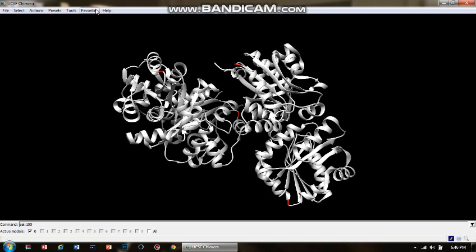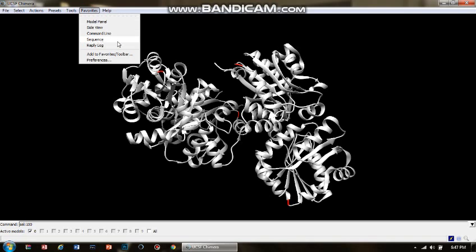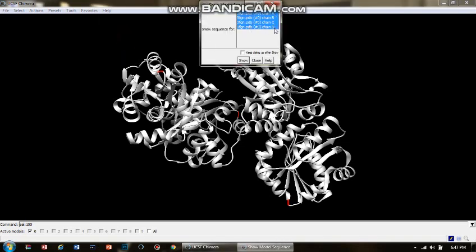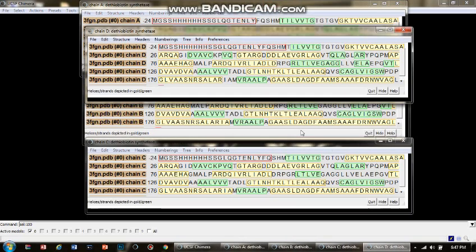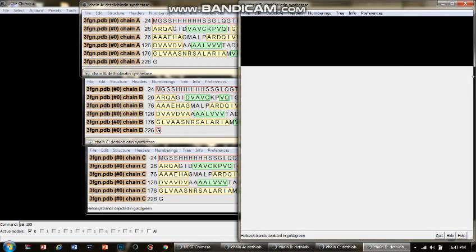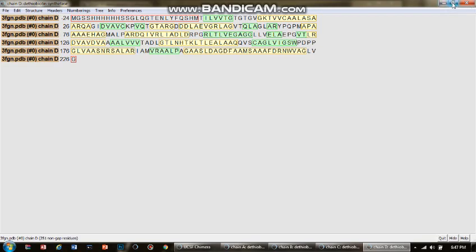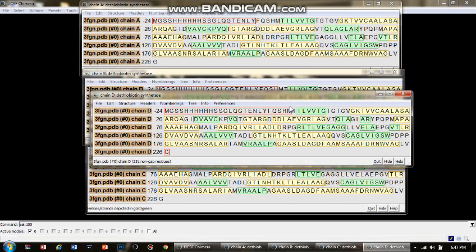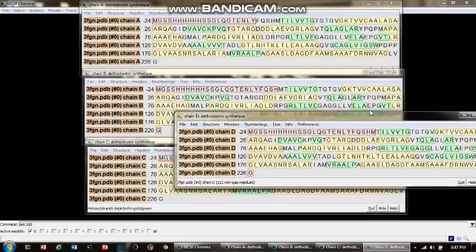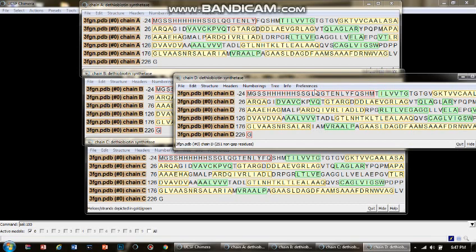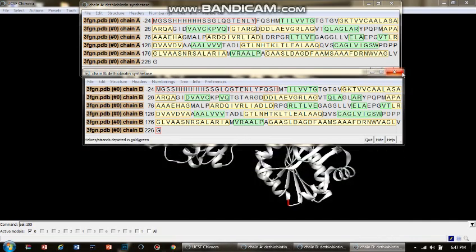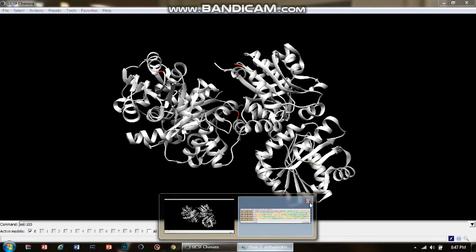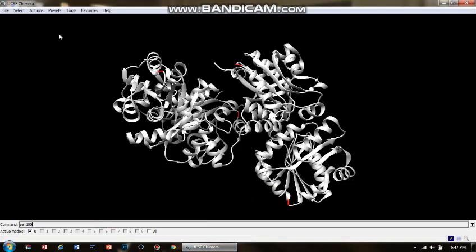The fact that all amino acid residues at position 100 in all chains were selected suggests that all the chains have identical sequences, meaning this protein is a tetramer active in that form. To confirm this is a tetramer, we go to Favorites and visualize the sequence for all chains A, B, C, D at once. Clicking Show reveals four chains, and I can clearly see they all have identical sequences.